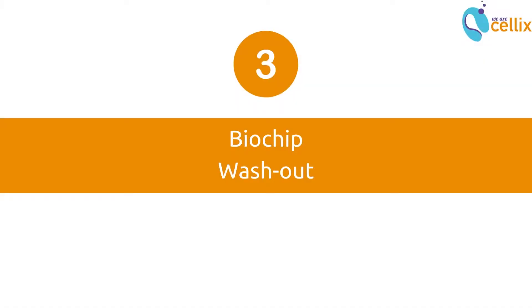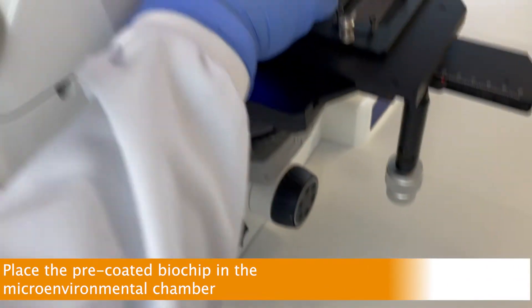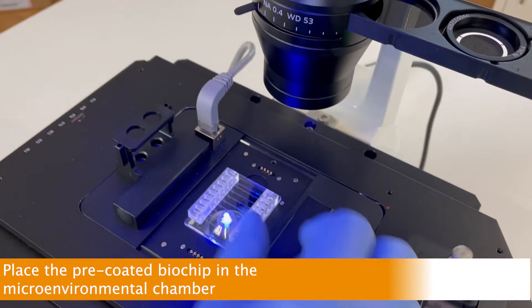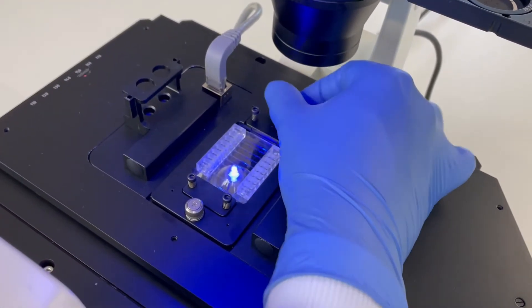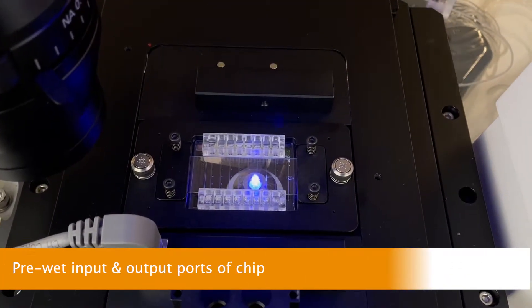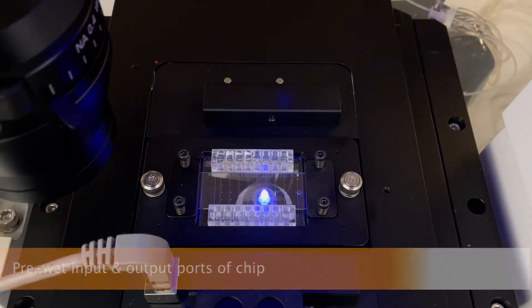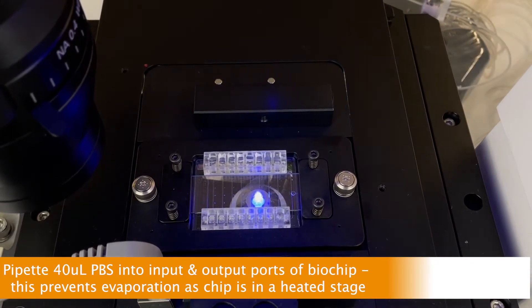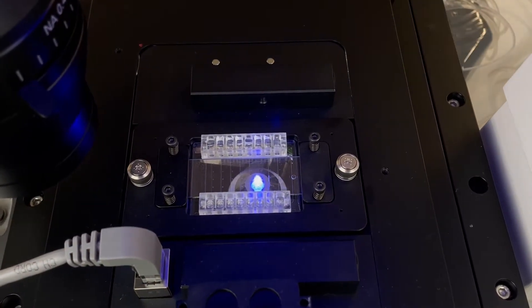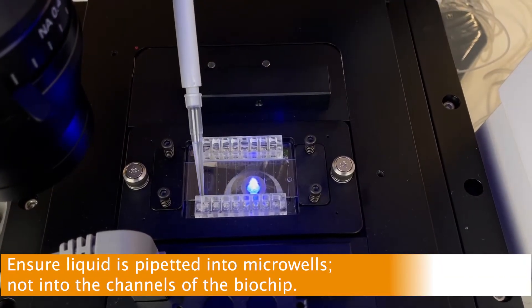The next chapter is preparation of the biochip for the assay. First, place the biochip in the microenvironmental chamber as shown — this heats the chip to 37 degrees Celsius, suitable for cell-based assays. To prime the channels of the biochip, first pre-wet the input and output ports to prevent evaporation. This is achieved by pipetting 40 microliters of PBS into the input and output ports of the chip. Ensure the liquid is pipetted into the microwells, not into the channels of the chip.